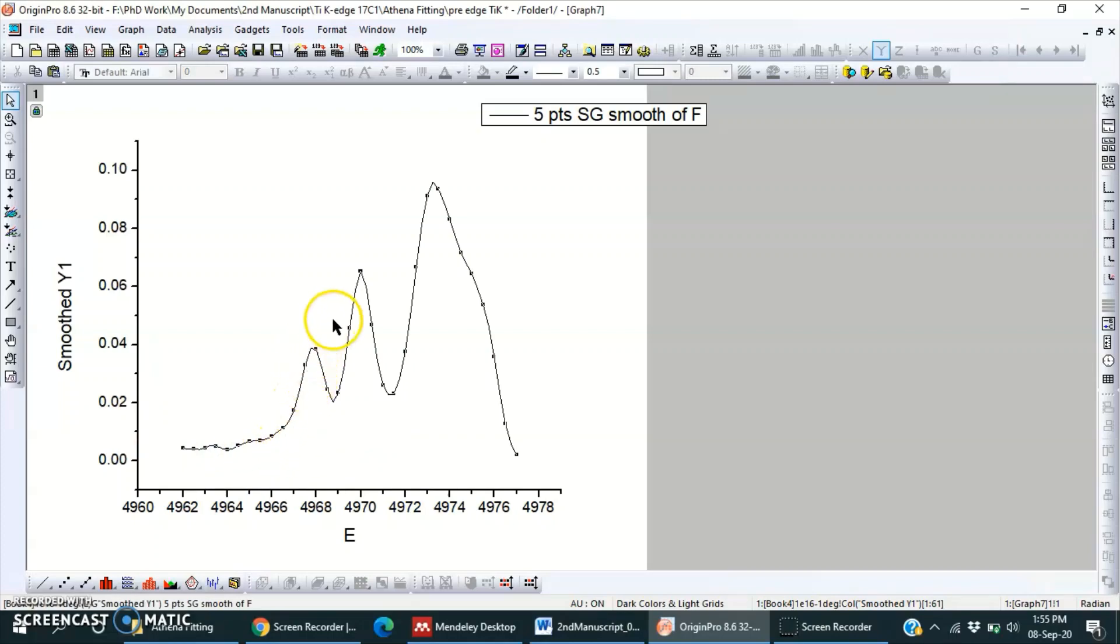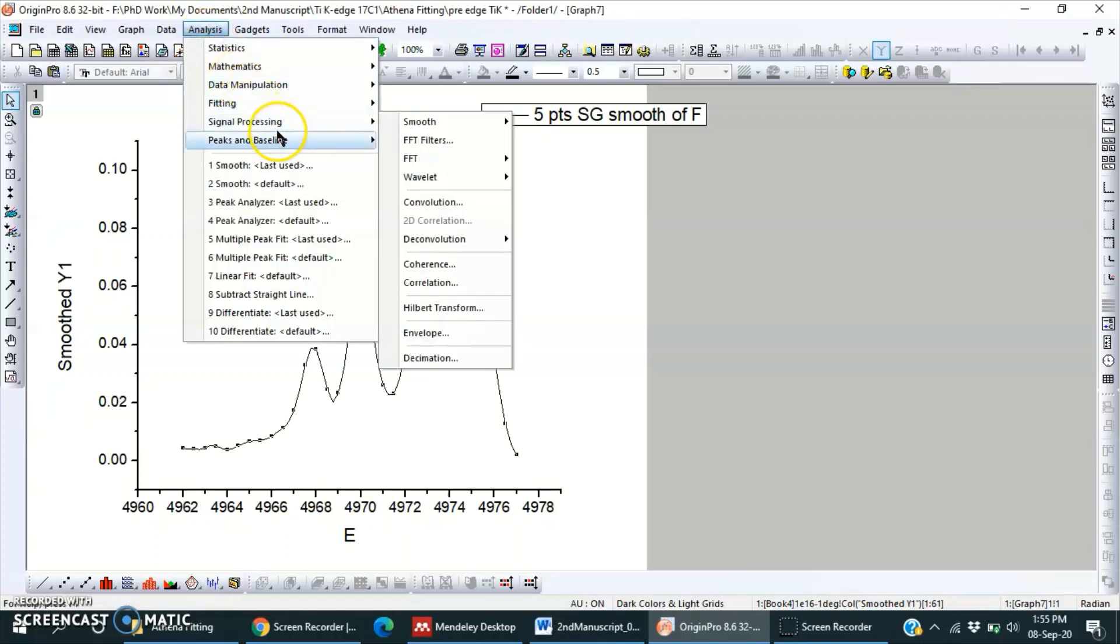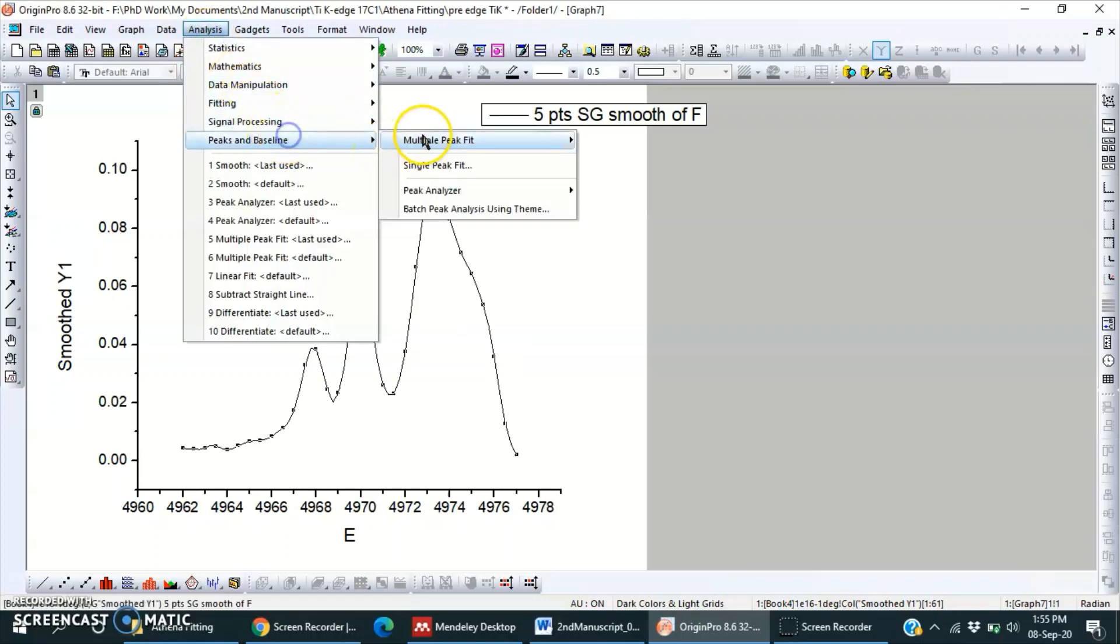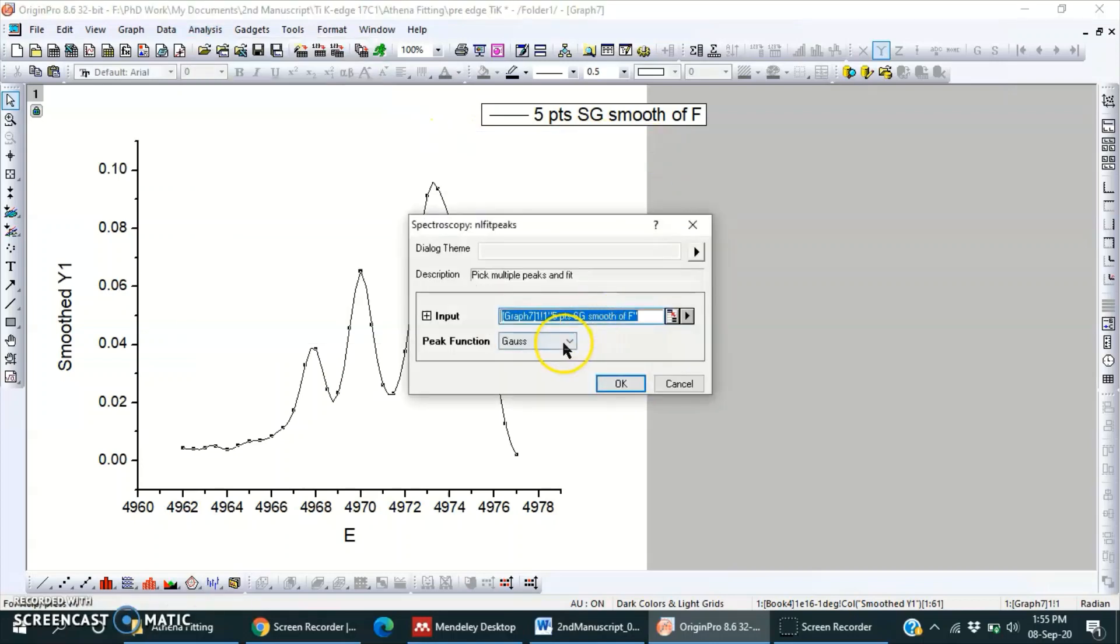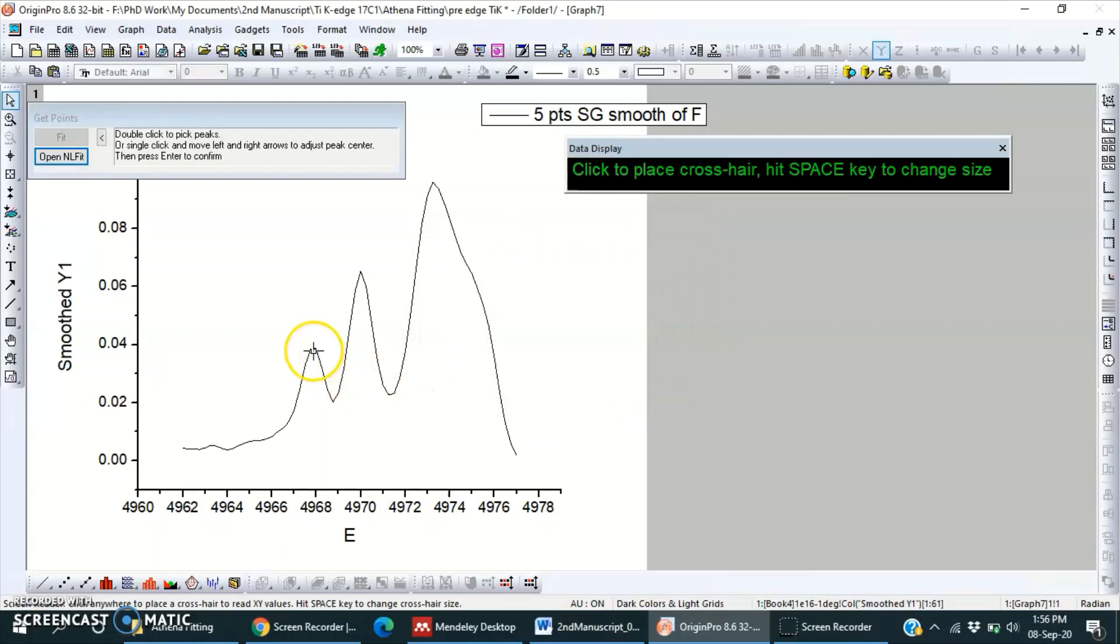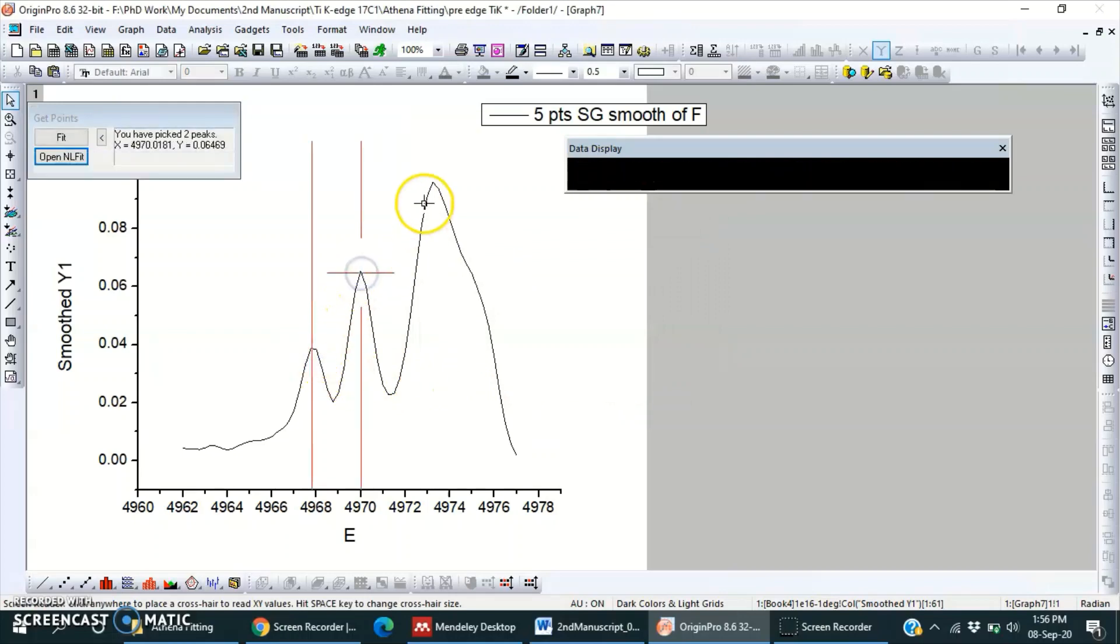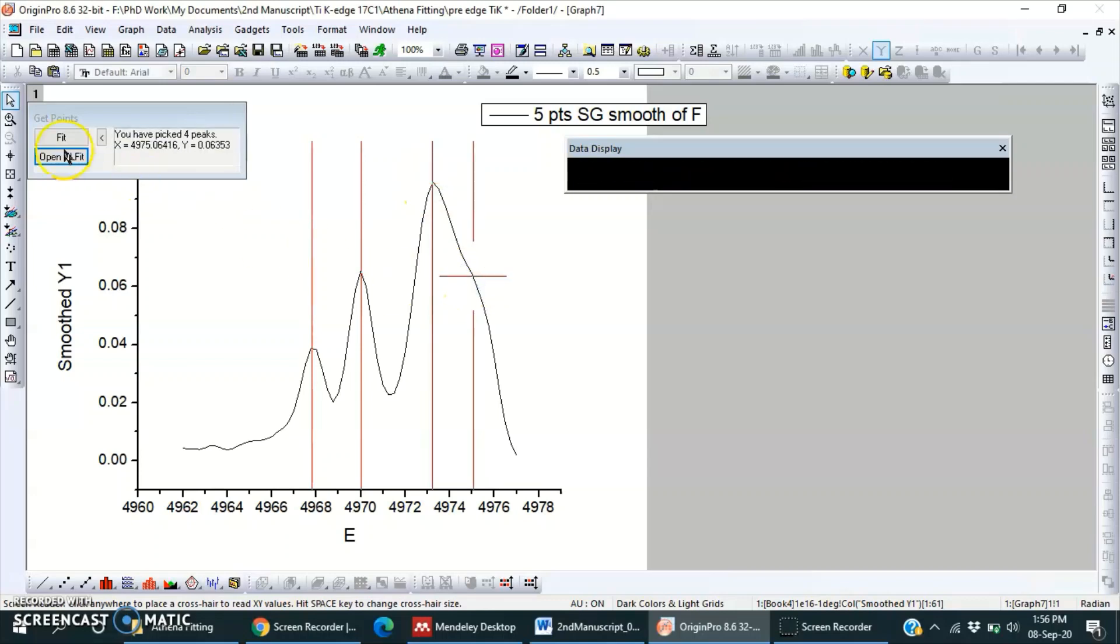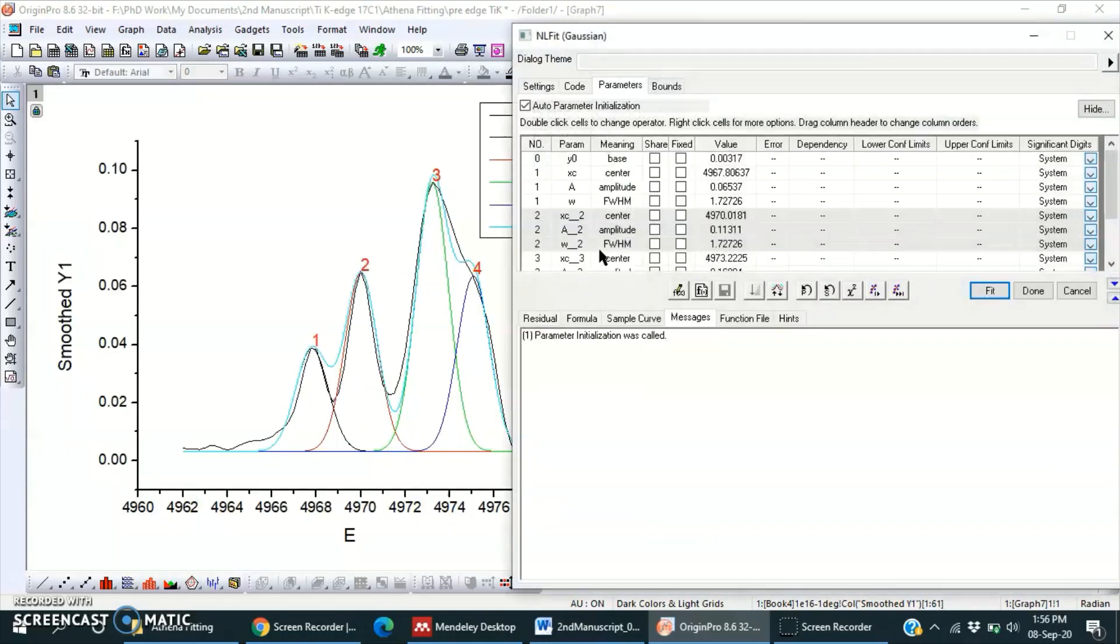Now we can fit these four peaks here using multiple peak fit, Gaussian, 1, 2, 3, and 4. Then open and fit, yes.